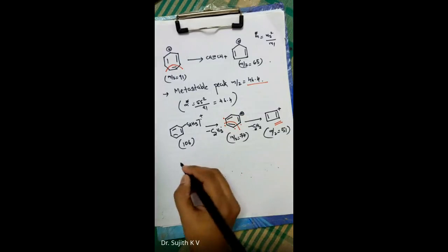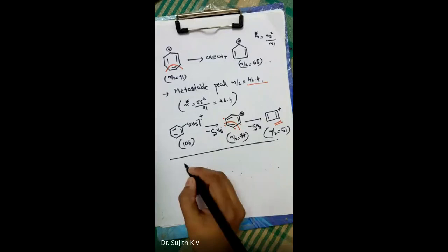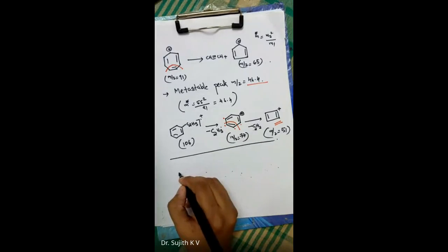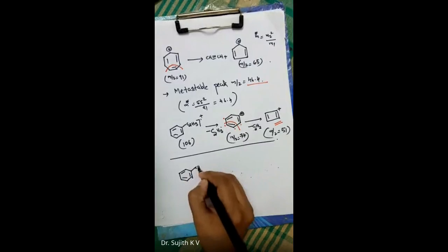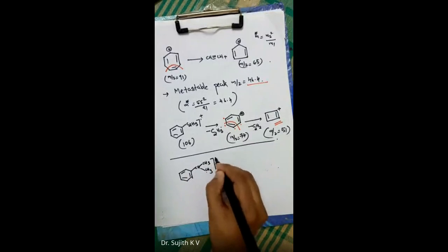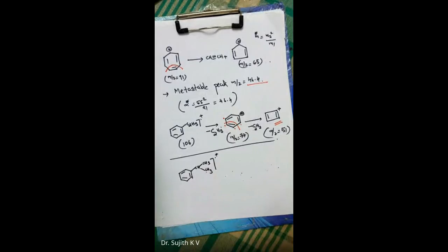In the case of ethyl benzene, the discussion is over. Now another one, and I'll be discussing only the prominent peak, that is isopropyl benzene. Its name is more familiar, not as isopropyl benzene. It has a short name or nickname called cumene, that you have seen in the case of the preparation of phenols. Phenol is normally prepared from, the starting material is cumene, right?